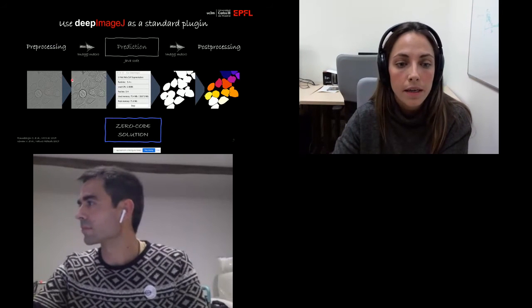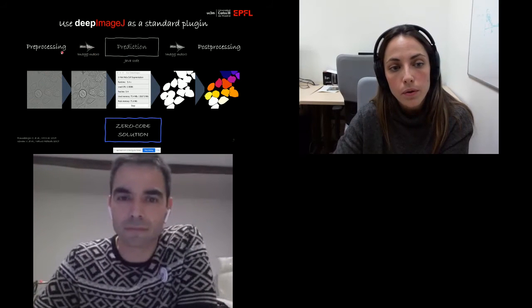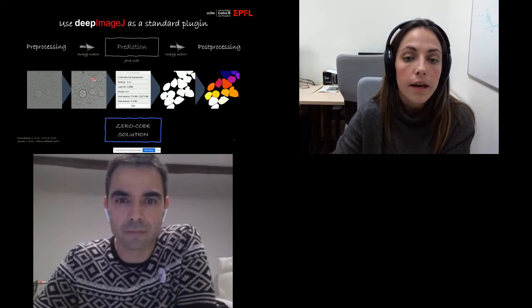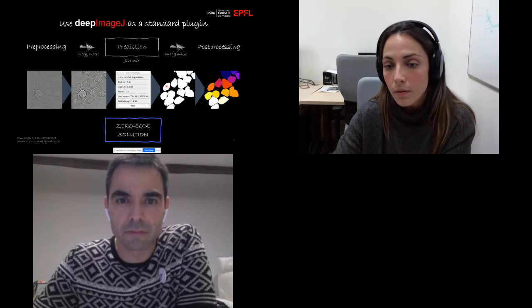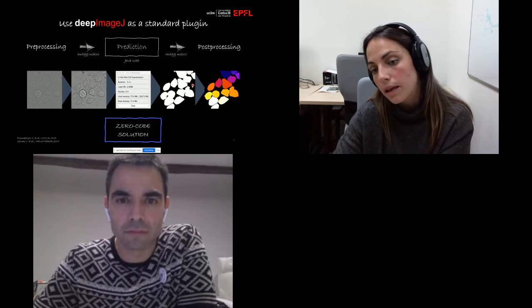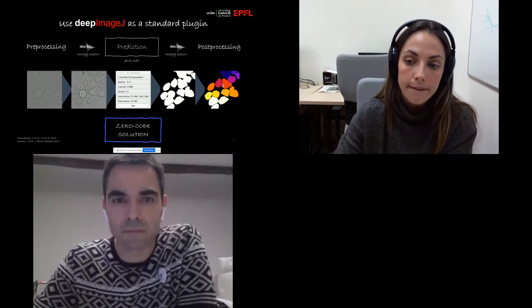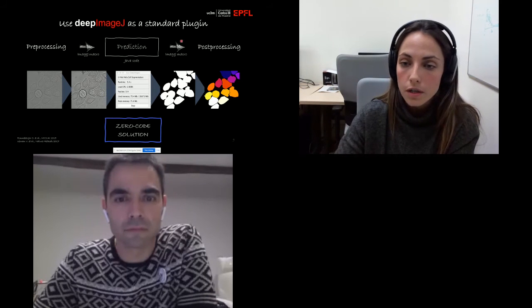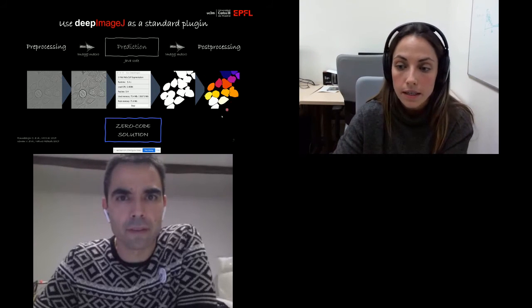Inside, what will happen is this. You just open the image, and through the ImageJ macro, the image is getting pre-processed, so normalized, for example. And the plugin is going to do the prediction. So this is kind of transparent for the user. Finally, when we have the raw output, most of the time you need to do some kind of post-processing to get really the interesting part of the output that you need for your research. So there's also a chance to have a macro for post-processing and get the final instance segmentation.